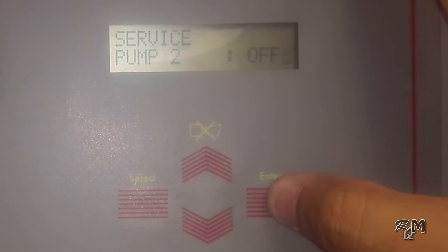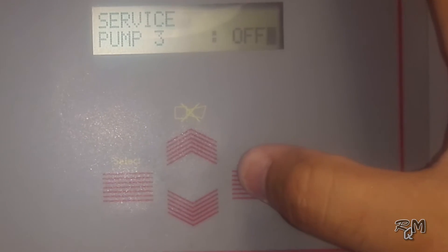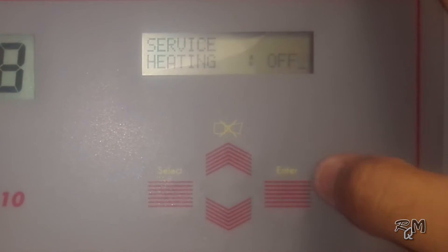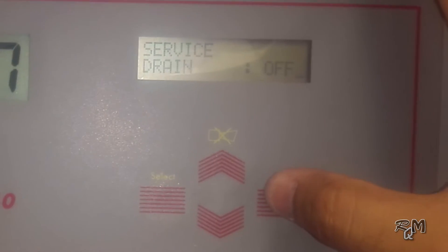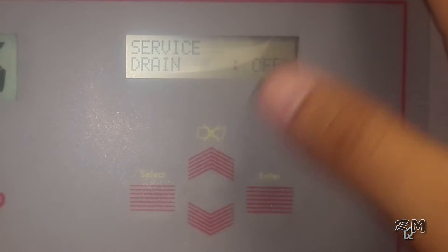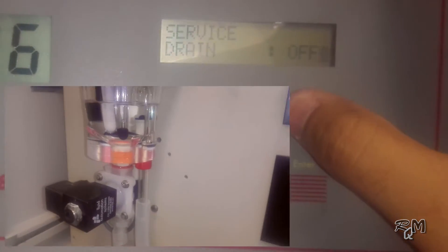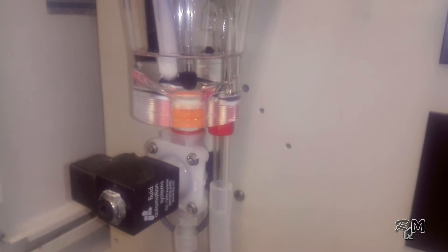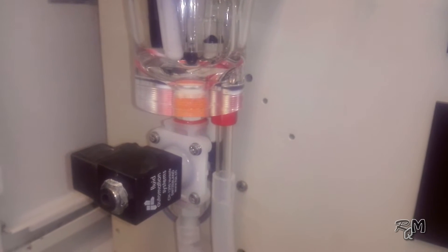Injection tubes are very important here. Both pump injection tubes should be placed behind the siphon tube or behind the level sensor. By this way, reagent will mix properly in the sample and prevent direct effect on the electrodes. Be sure they are not touching the top of the level sensor. Press Enter to move to the next menu — pump 3, pump 4, and heating options are not utilized in this application. Then go to the next menu related to the drain valve. Verify drain valve working by switching it on and off and observe that the sample is draining properly.